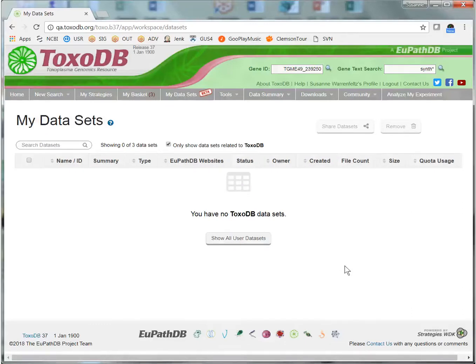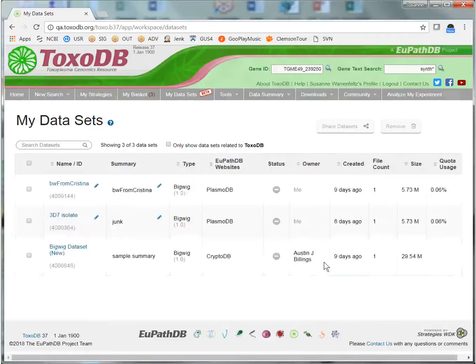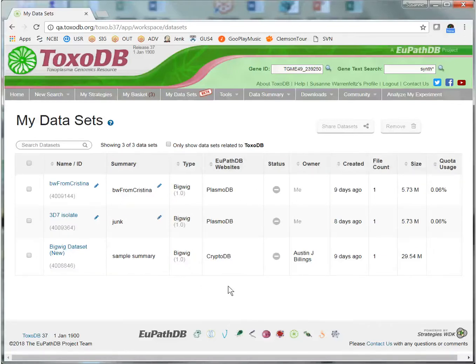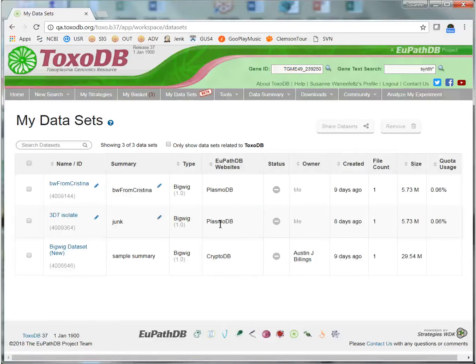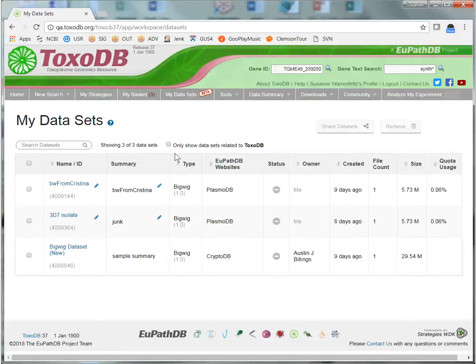Right now I have no datasets associated with the genomes in ToxoDB, but I can click on this button and see datasets that I have associated with other EuPathDB sites. I have two datasets associated with Plasmodium genomes and one dataset in CryptoDB.